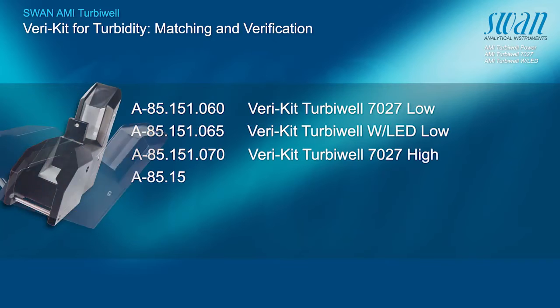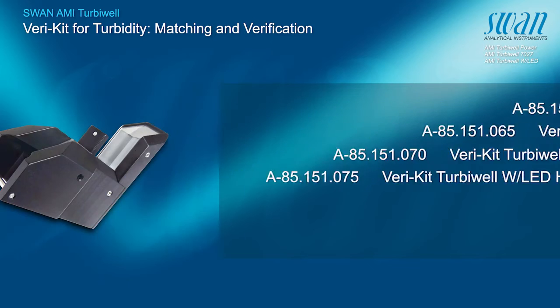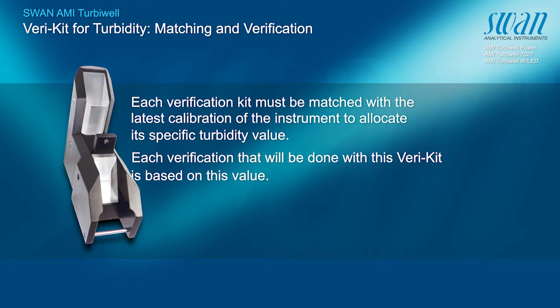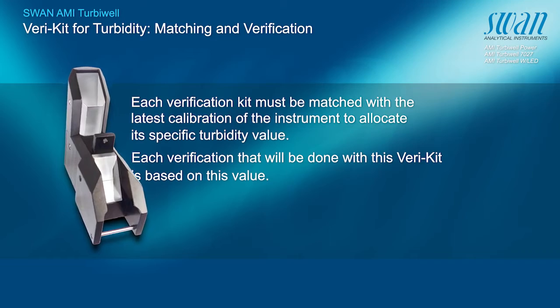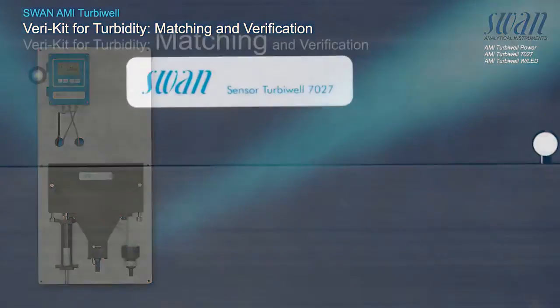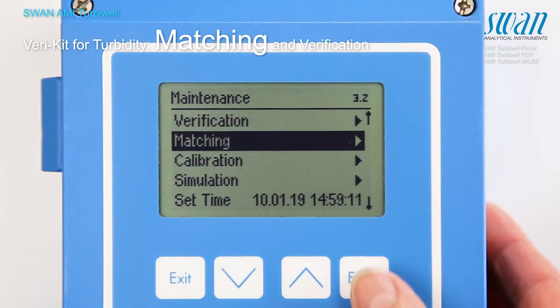The following solid verification kits are available. The matching procedure is menu-guided.